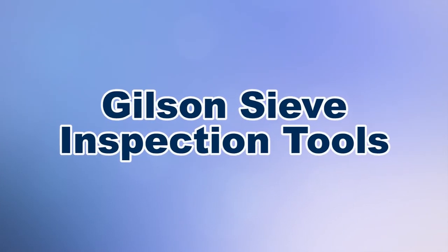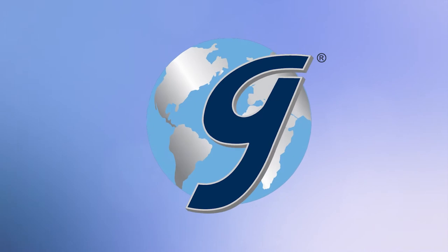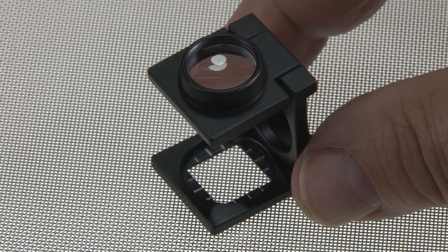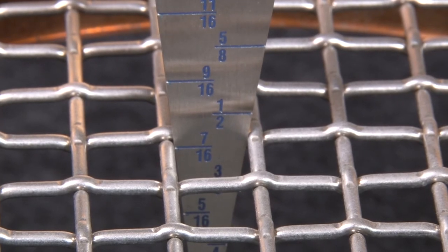When your quality assurance program needs the right tool for test sieve examinations, then Gilson is the right choice. Gilson's sieve inspection tools allow examination of sieve cloth for size, damage, and inconsistencies as part of routine maintenance or a quality assurance program.